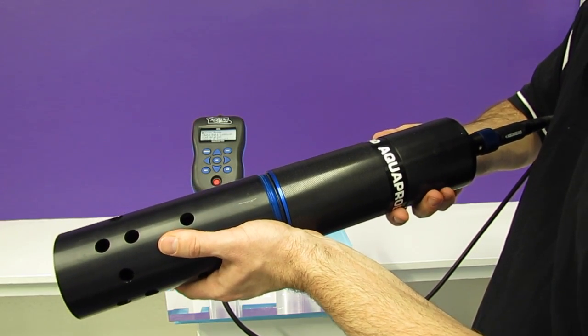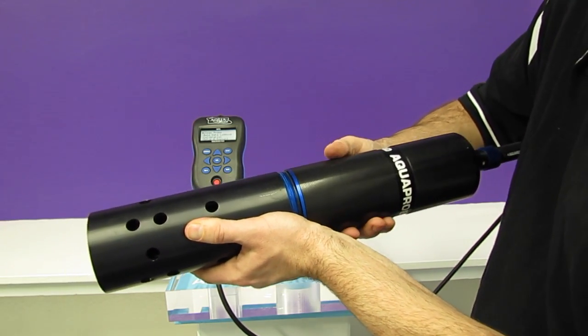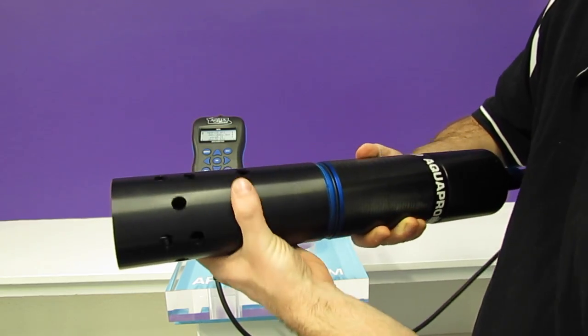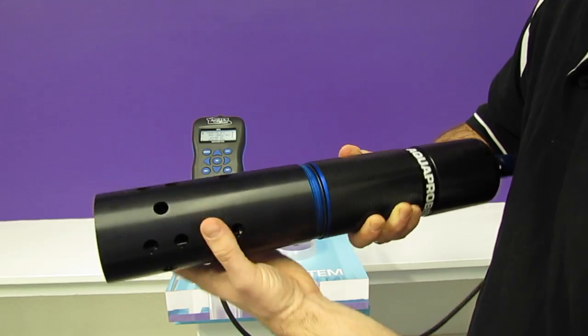This is the AP7000 AquaProbe from AquaRead. As you'll see, it's substantially larger than the AP2000 and AP5000 because it has the potential to hold more sensors and because of its central self-cleaning system.